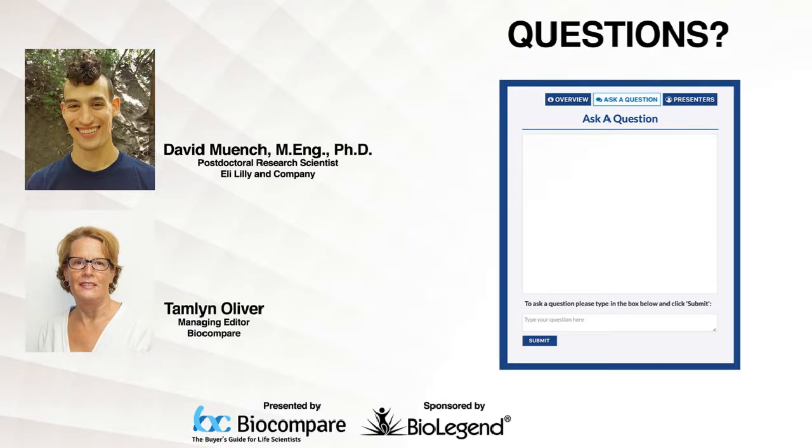Good question. So for our very first experiment, BioLegend had only just launched their product line, and it was just lucky for us that the 4 markers were relevant to our analyses of granulopoiesis. And then later for our expanded analysis, the product line had expanded, but our goal was not really to perform an exhaustive CITE-Seq experiment using as many markers as we could, but rather we wanted to focus on the markers that were relevant to granulopoiesis.